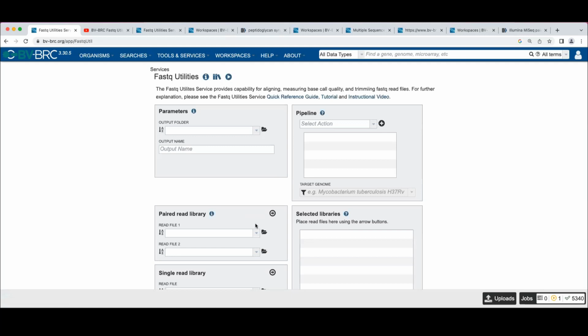If you're more bioinformatically inclined, you'll look at read quality. From my perspective, if you're a biologist, you want to be sure everything was sequenced right before you try anything else. So that's the way I do it.